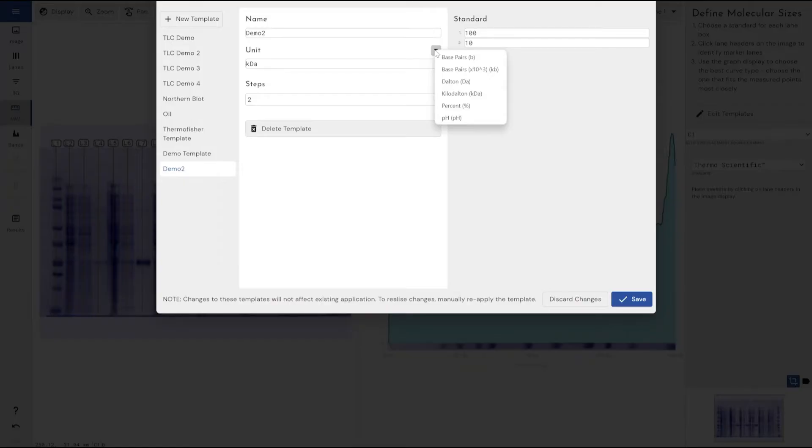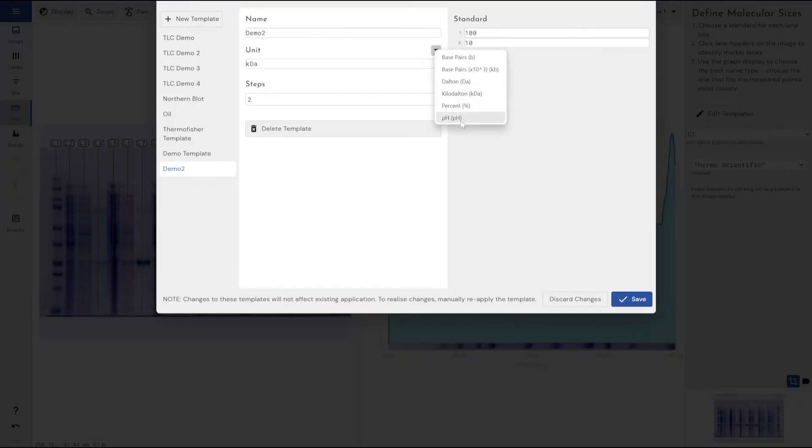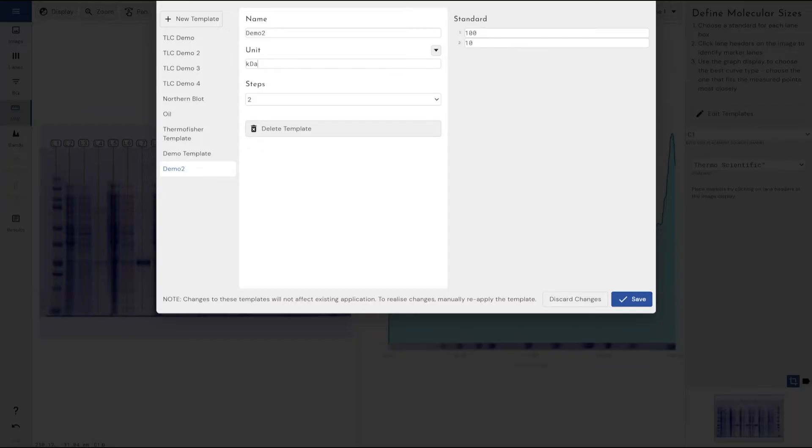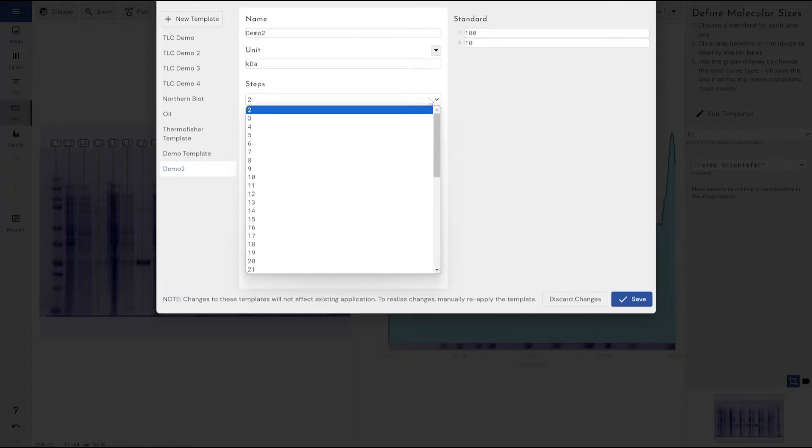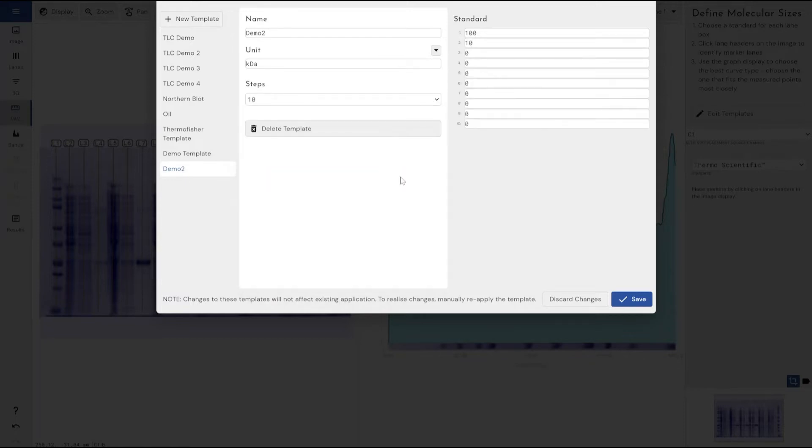I can select the units that my molecular weight is going to be displayed in. Am I using proteins within the kilodalton range, so then I will need to use kilodaltons. Am I using RNA or DNA? Do I want to use percentage or pH as part of the development of my molecular weight ladder or my standard ladder? What units have I done it in? Just make sure that lines up because then your results will be reported in the unit that you've chosen. And then you've got the number of steps, and this is just the number of points, the number of bands you would expect to see as part of your molecular weight ladder.